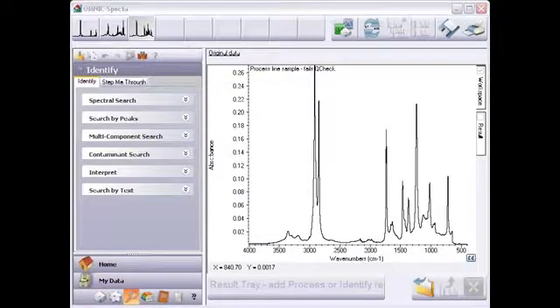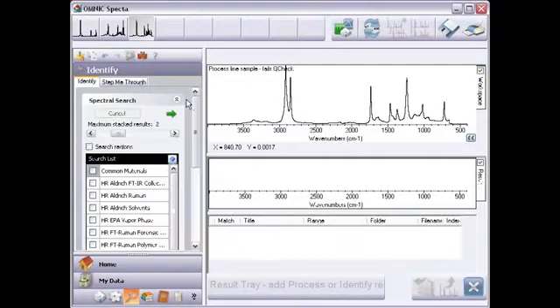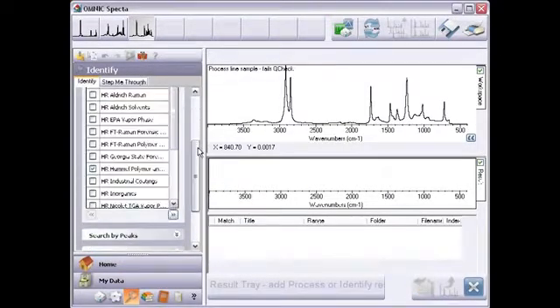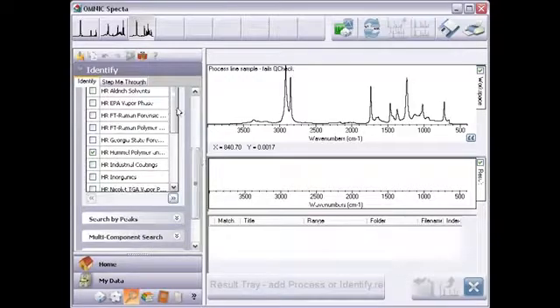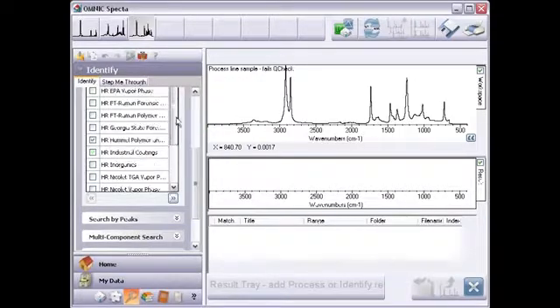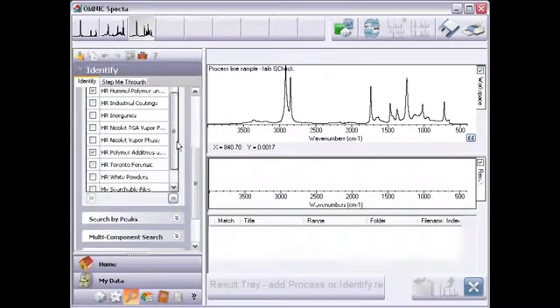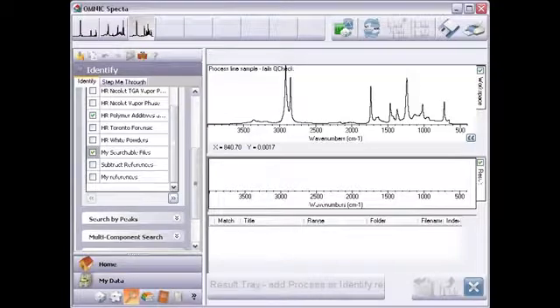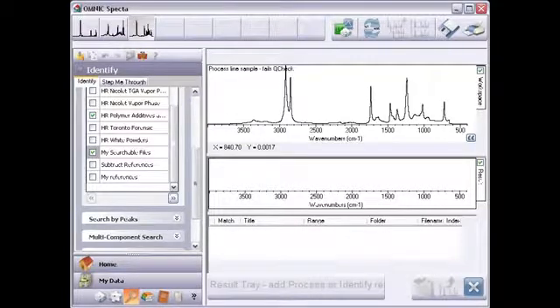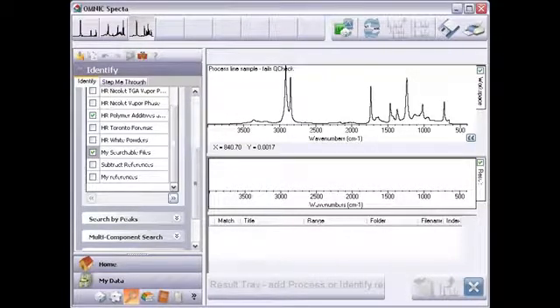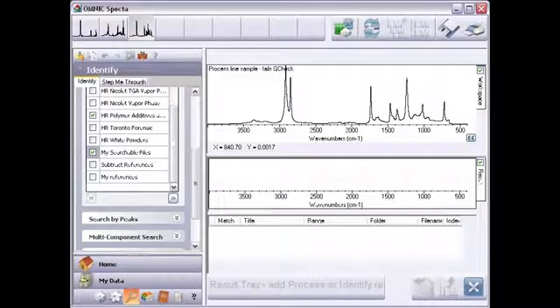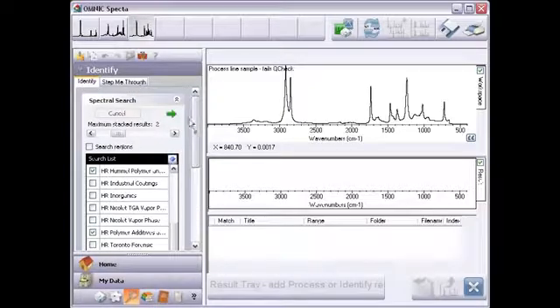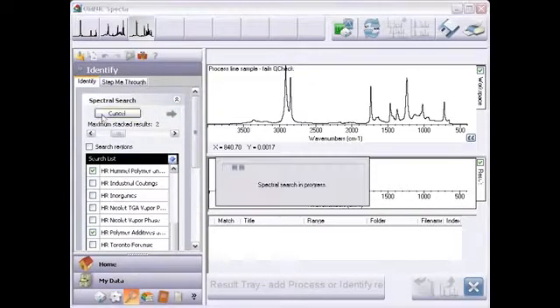I'll start by running a spectral search on the sample to confirm the main component. For libraries, I'll leave the two we used in the previous example and add my Search Favorites folder, which contains a series of reference spectra collected from the same production line and analyzed using the same spectrometer and accessory as the contaminated sample. Taking this precaution ensures an exact comparison and produces better results.